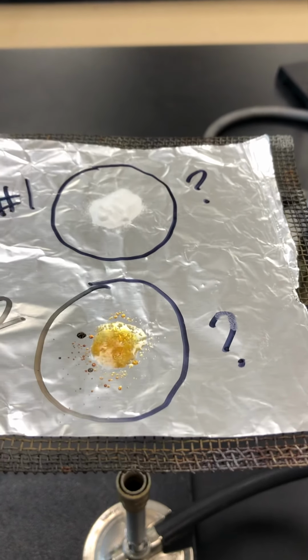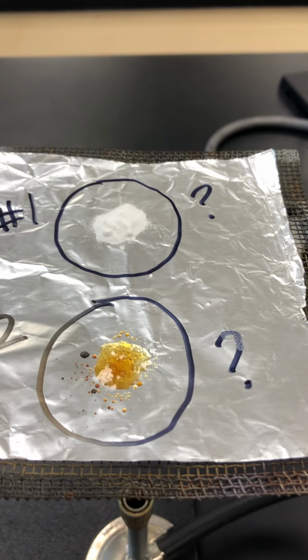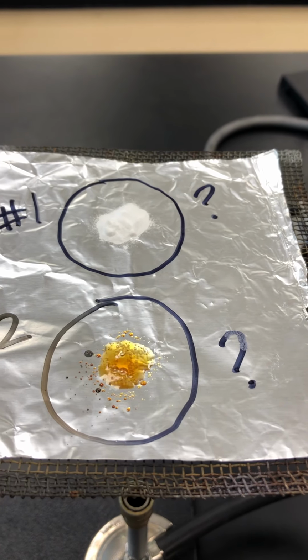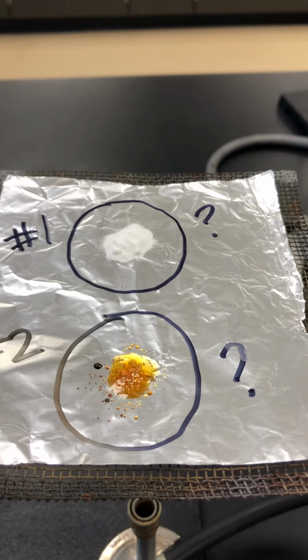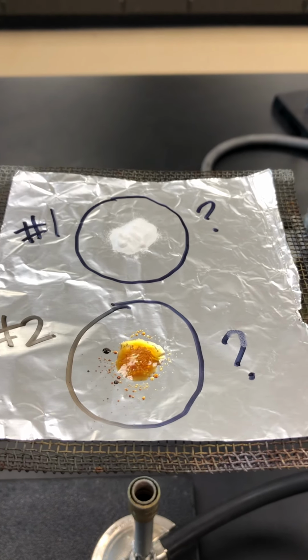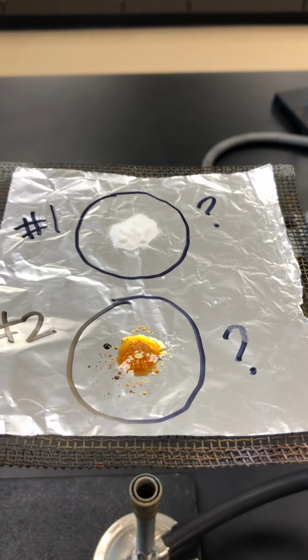And you can go ahead and record that data in the data table. So that's it for the melting point tests for the Ionic versus Covalent substances lab.